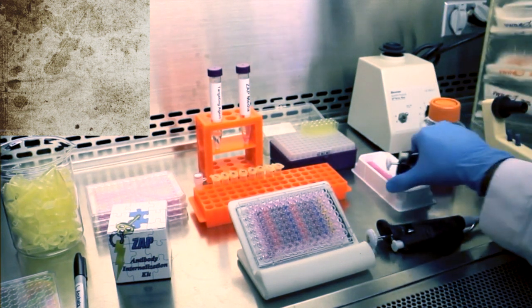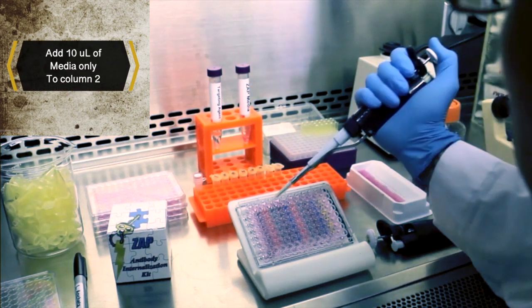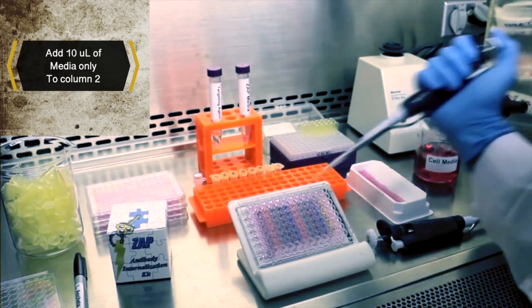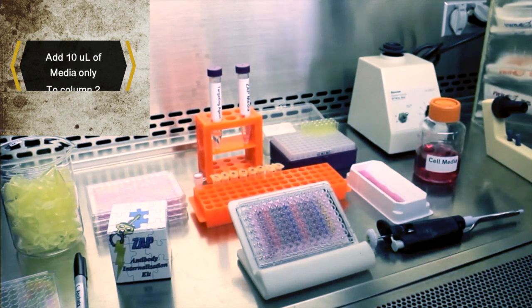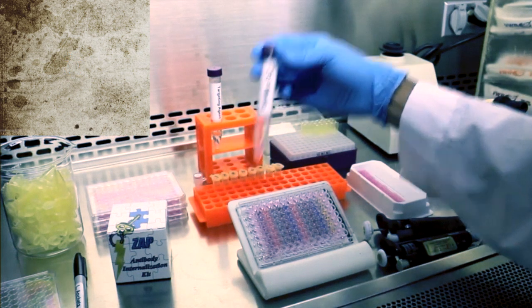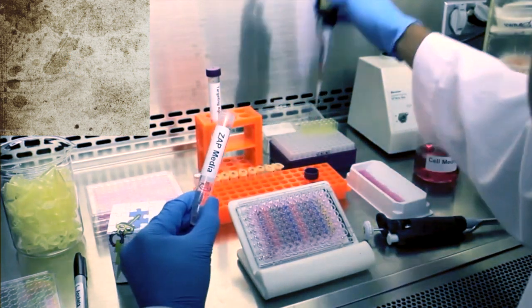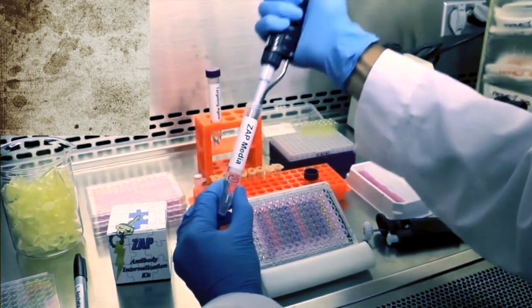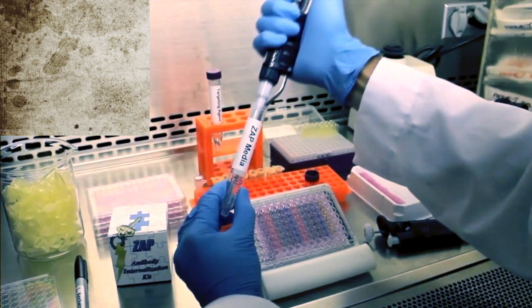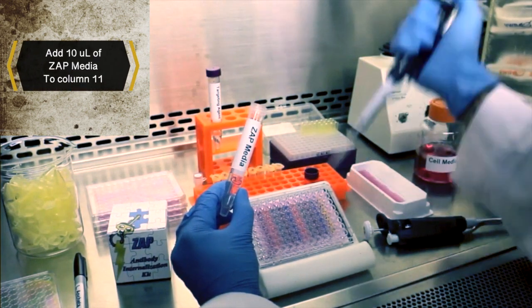Start by adding 10 microliters of cell media to each of the 6 wells in column 2, labeled Cell Media Only. Next, take your vial labeled ZAP media and vortex briefly. Then, add 10 microliters into each of the 6 wells in column 11, labeled ZAP media only.